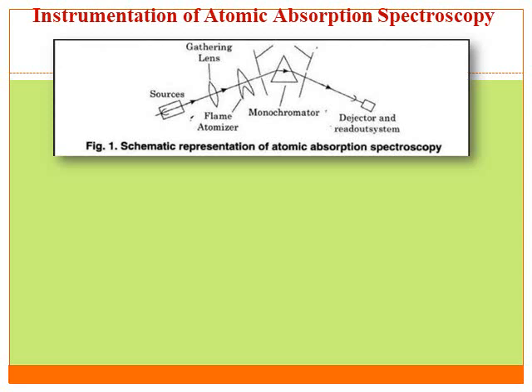droplets and vaporized, and when it gets vaporized, the atoms get excited into the excitation state with different excitation states, and some of the atoms will remain in the ground state. In atomic absorption spectroscopy, some of the atoms which remained in the ground state are also capable of absorbing a certain frequency of their own wavelength, and that absorbed radiation will be gathered, passed through the lens, and synchronized with the monochromator.